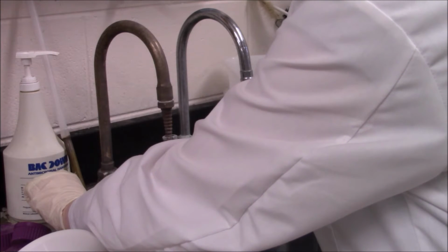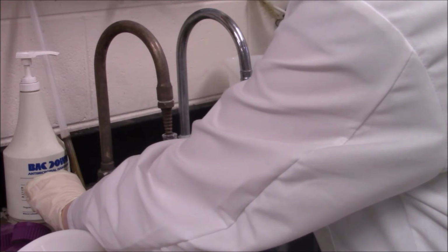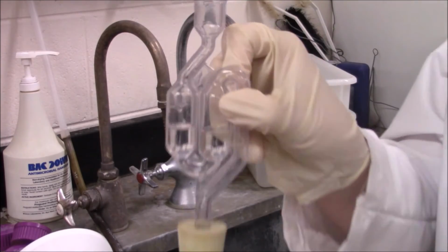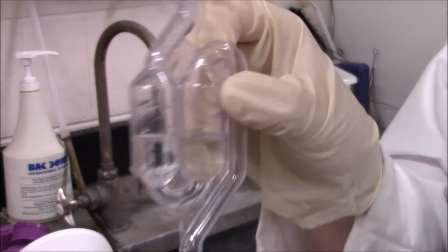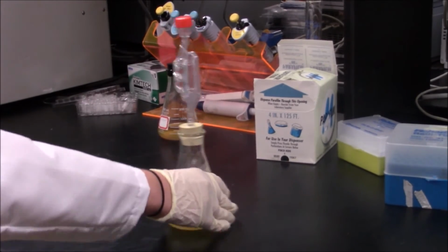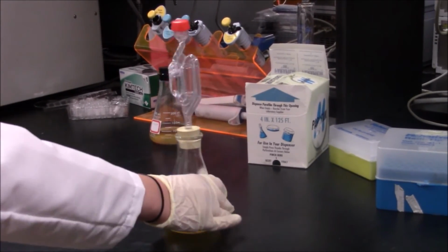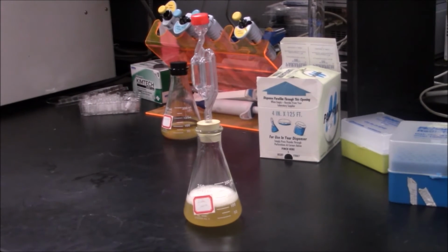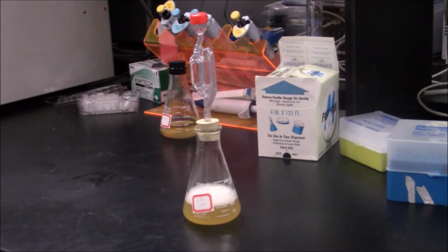Bubbles of CO2 should be produced throughout fermentation after a startup period. The purpose of the airlock is to allow bubbles to escape and keep other substances from entering, like air. Either a simple rubber stopper or another airlock can be used for the control solution. The airlock has the advantage of allowing one to more effectively observe the lack of carbon dioxide production.